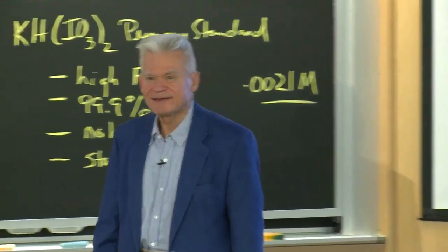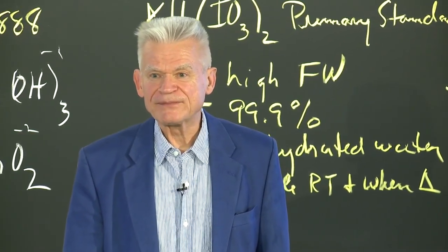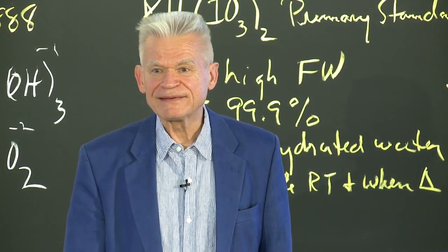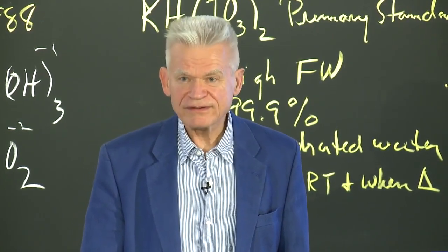Starch reacts with iodine, and it creates the blue color. So when we were titrating it, it turned really pale. It's really hard to tell if it was clear or not. So adding the starch helps indicate whether or not you've gotten rid of all the iodine. Good. That's very good.